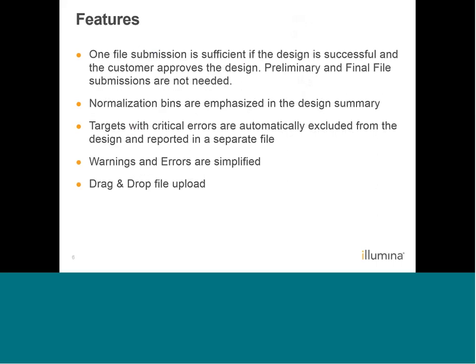Normalization bins are emphasized in the design summary, and normalization bins are used by the iScan scanner for red and green color balance during scanning. Targets with critical errors versus warnings are automatically excluded from the design and reported in a separate file. The warnings and errors are simplified, and again, we're going to go over that in more detail. And finally, you can drag and drop to upload your input files.